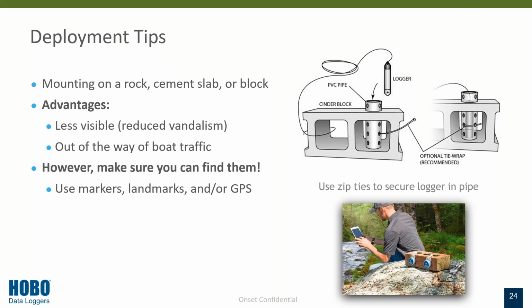And again, they are out of boat traffic, so you don't have to worry about them floating around and getting hit by any propellers or anything like that. However, because they are deployed underwater and mounted down and not floating up, you do want to make sure that you have some kind of marker, like a flag or something, to help you find them when you are ready to collect that data.